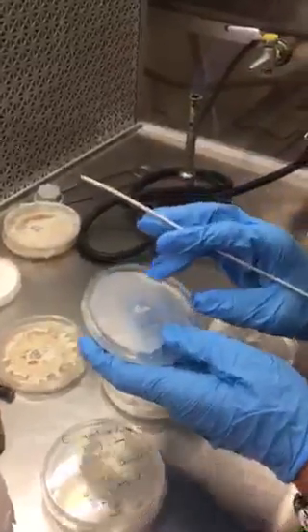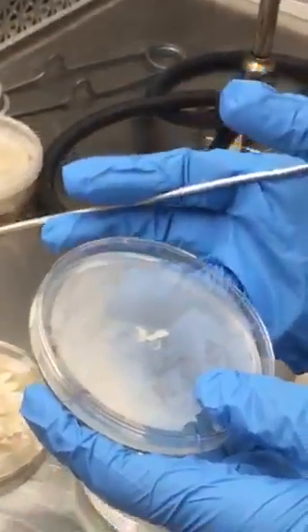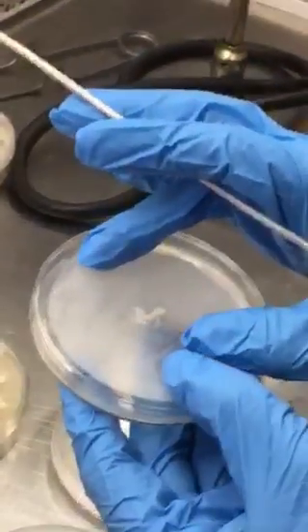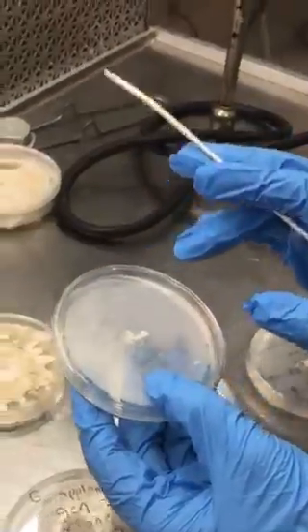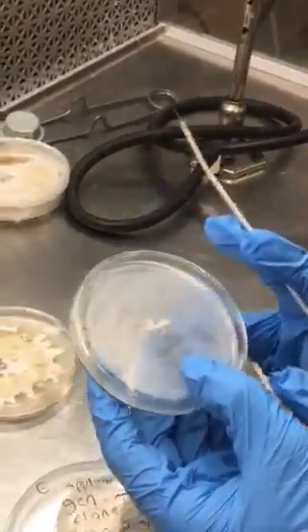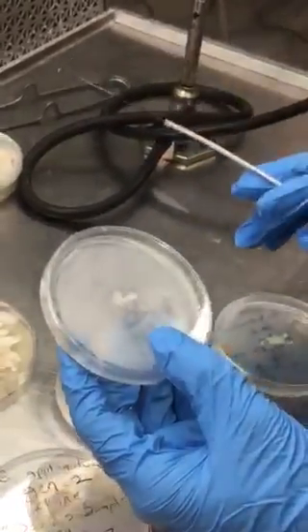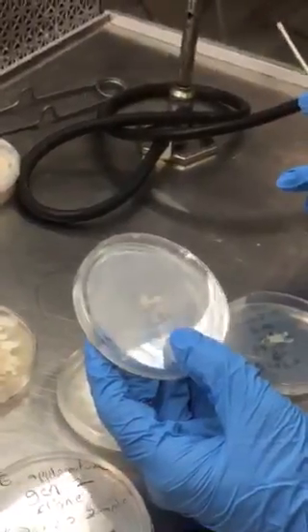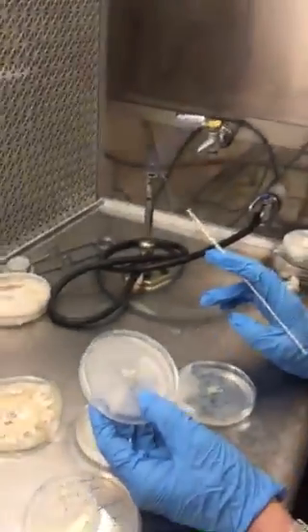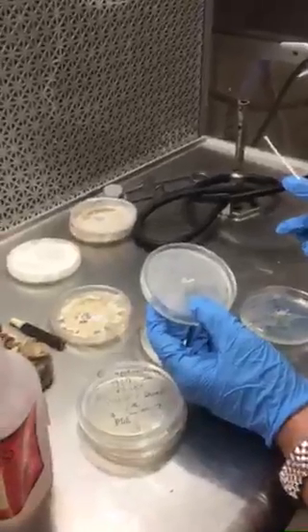One thing I forgot to mention — make sure you label your dishes first on the bottom. I prefer to label them on the bottom so that I can watch my mycelium grow on the top surface. That's very important for visual identification, as well as keeping a consistent labeling method. Make sure you get the generation number, the date, your initials so you know whose it is and who isolated it.